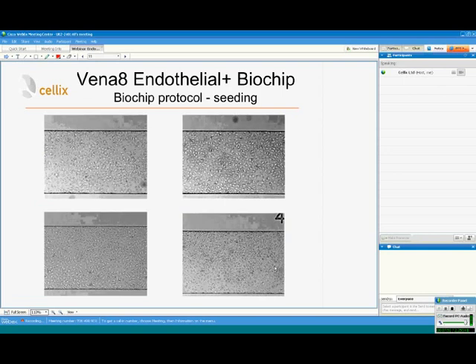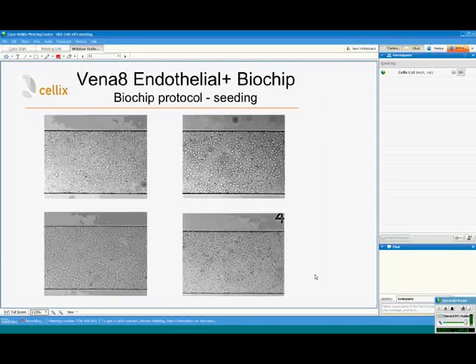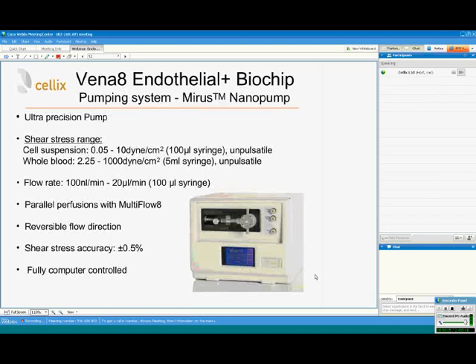This is how it looks after two hours of cell seeding and proliferation. These are images of four different separate channels inside the biochip, showing the confluent layer of primary HUVECs.